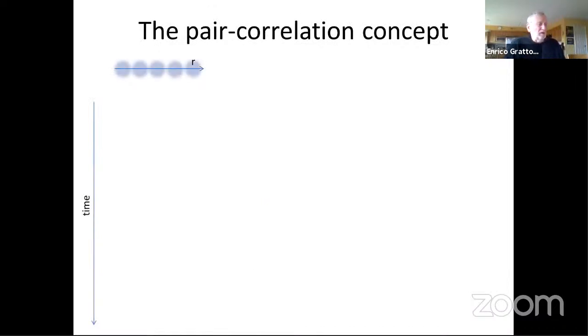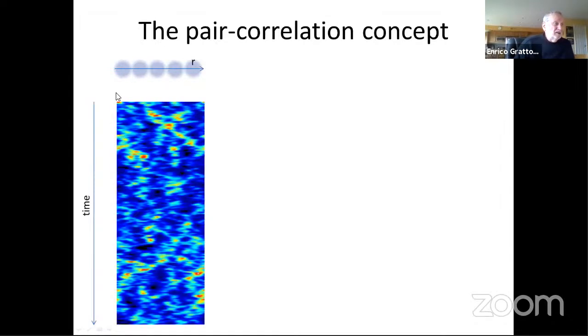Okay, let us see how we will analyze. So for the moment, let us concentrate on the simple concept that we can measure the intensity along a line. And so those are points in a line. And how will that appear? So if I plot that position here, that position in a second point, so I plot what is called the carpet, so that each position along a line is plotted in this axis, and then as a function of time is plotted in this axis. And then I say, well, maybe you can see that there are some fluctuation that propagates along a diagonal, which is very likely to be the same molecule that simply is moving in this direction.